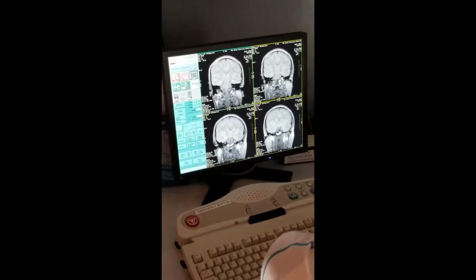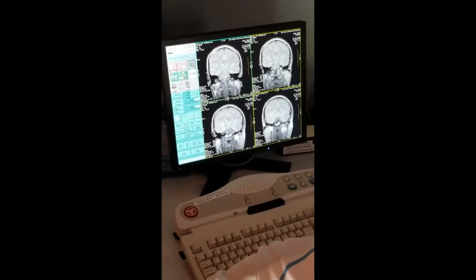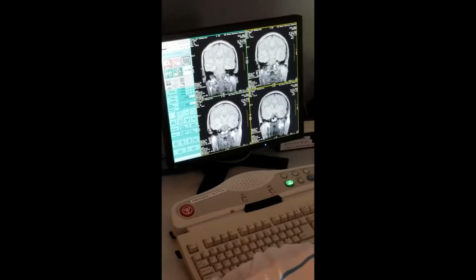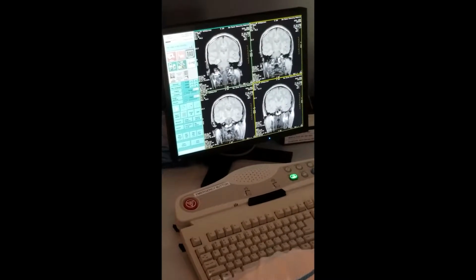Okay. This is all you guys are going to do. Once you let go, all of them change. Then it's 4:1. Okay. You see that? I just changed it. Okay. There's a little motion here.